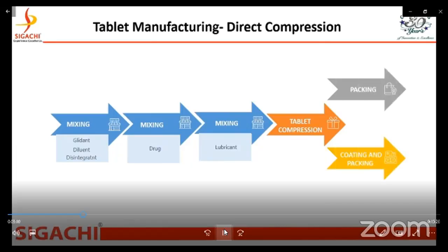Direct compression is a popular choice because it provides the shortest, most effective, and least complex way to produce tablets. The manufacturer can blend an API with the excipient and the lubricant followed by compression, which makes the product easy to process, although the selection of an excipient and physical mixing of product is a main problem of tablets because it affects the quality of final product. So we are moving towards multifunctional excipient.